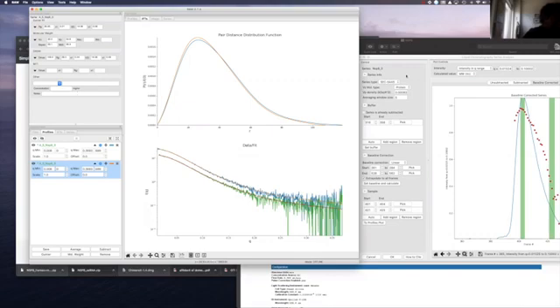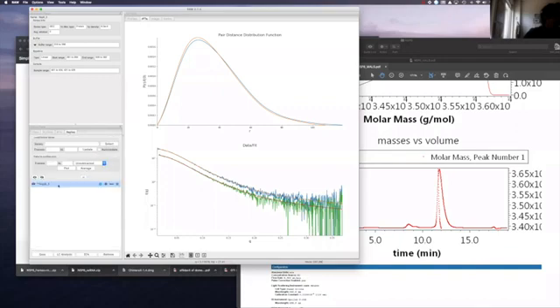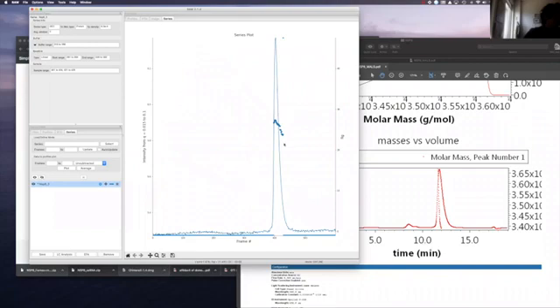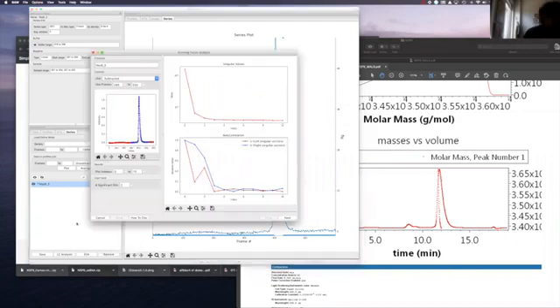So if you go back to your analysis and decide to do something more fancy, okay, we just click OK here, we don't need this now. But when you go again to the series, it's right here. Again, you have options for SVD, EFA or REGALS. EFA was mentioned today as a tool when you want to deconvolute, and we do SVD at the beginning and immediately recognize there are two components. One is very major, and there's a third component that is really minimal, but let's just assume there are two components to make the system a little simpler, 1 and 2, ignoring the 0 component.